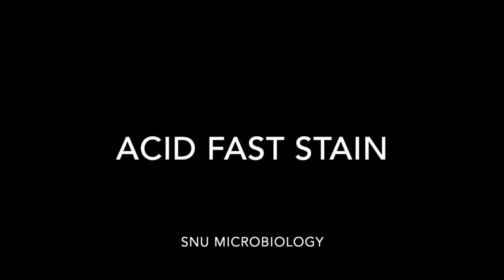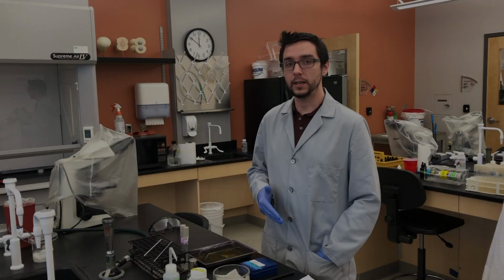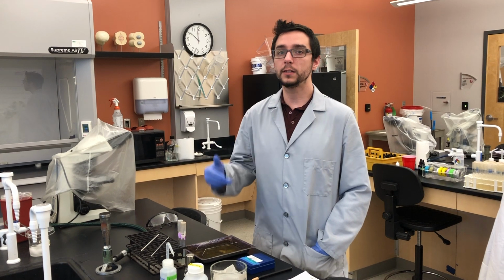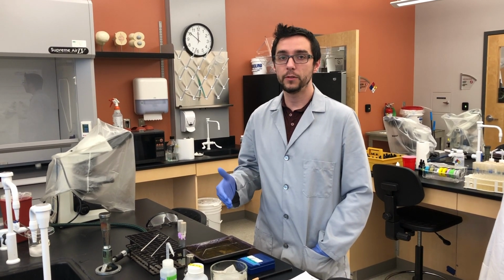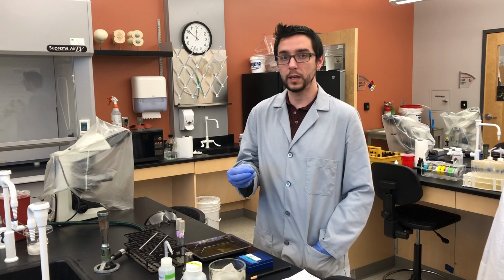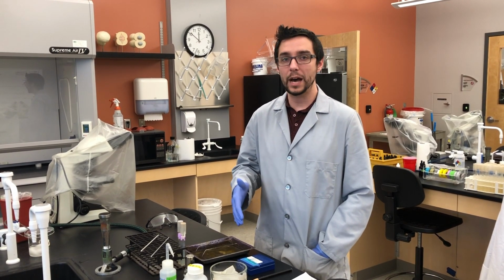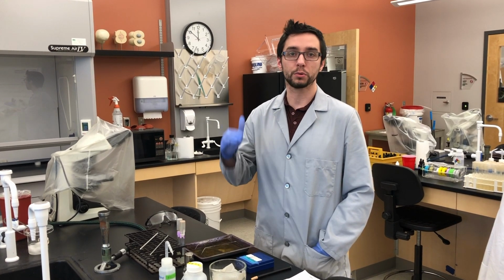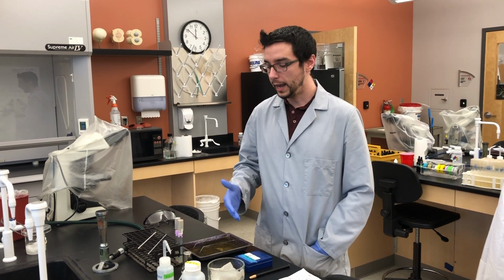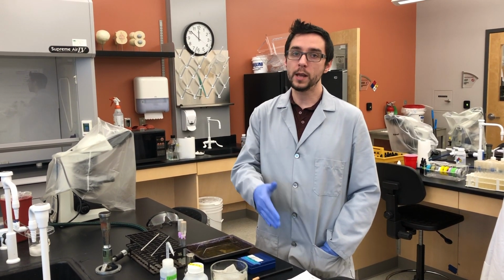Welcome to this microbiology video where we're going to talk about how to do an acid-fast stain. Now with acid-fast stains, what you need to understand is that this is a special type of gram-positive bacteria that have certain molecules known as mycolic acids incorporated within the cell wall that are extremely hydrophobic, not allowing many molecules through the cell wall. This makes them very difficult to treat and very difficult to stain as well, especially when you do a gram stain.